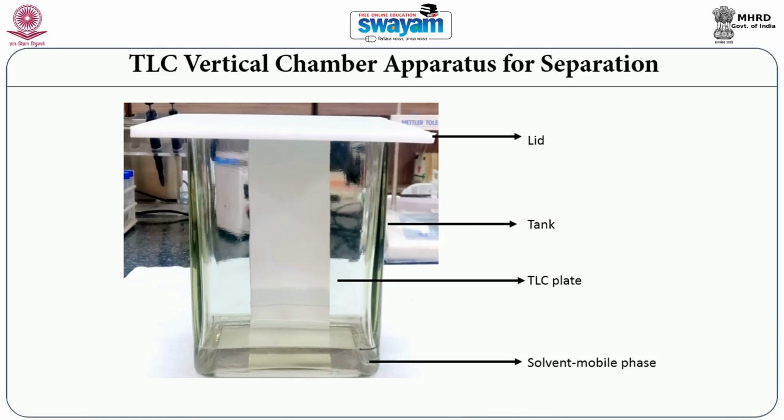In drier conditions, it occurs slower, but it is a little more uniform. So all of these factors have to be kept in mind. If the same experiment is being repeated in different seasons, you may see different results depending upon not only the composition of your solvent, the mobile phase, but also some of these atmospheric conditions.